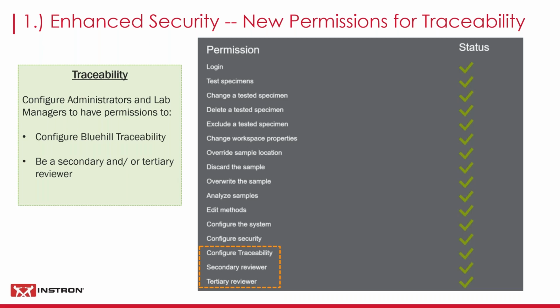So in summary, Bluehill Security is the first component of traceability, and using security is essential to set software permissions and configure users to determine who is doing the testing on the Instron system.